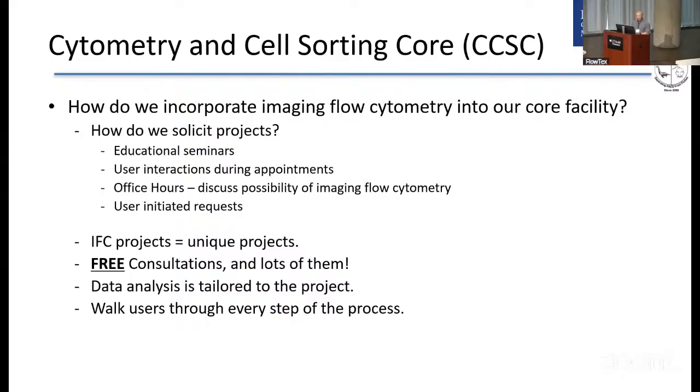We offer a lot of support for data analysis in particular, because that is probably the part that's the most different to standard flow cytometry, where users can have fully assisted analysis, basically done by us, partially assisted, or we can kind of throw them to the wolves and help them along the way. We have a lot of consultations with them. In other words, we will walk you through every step of the way as much as possible, because this is a technique that requires that.